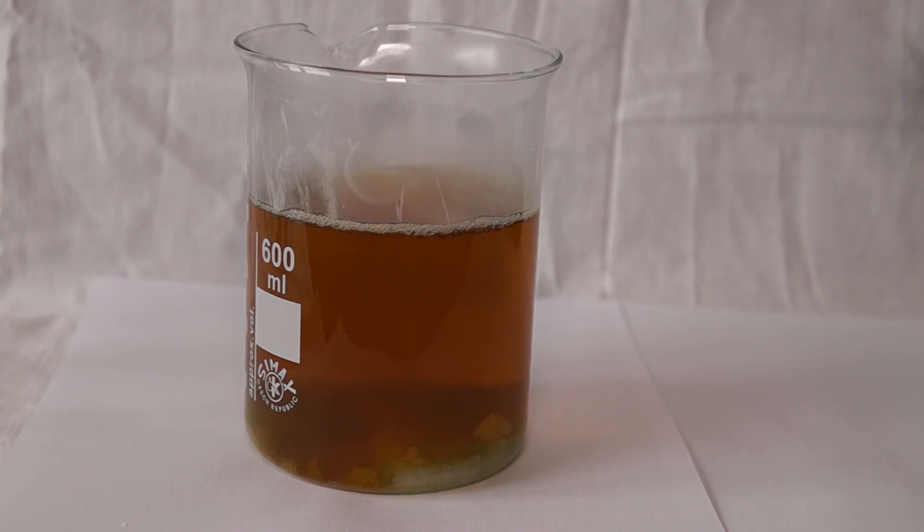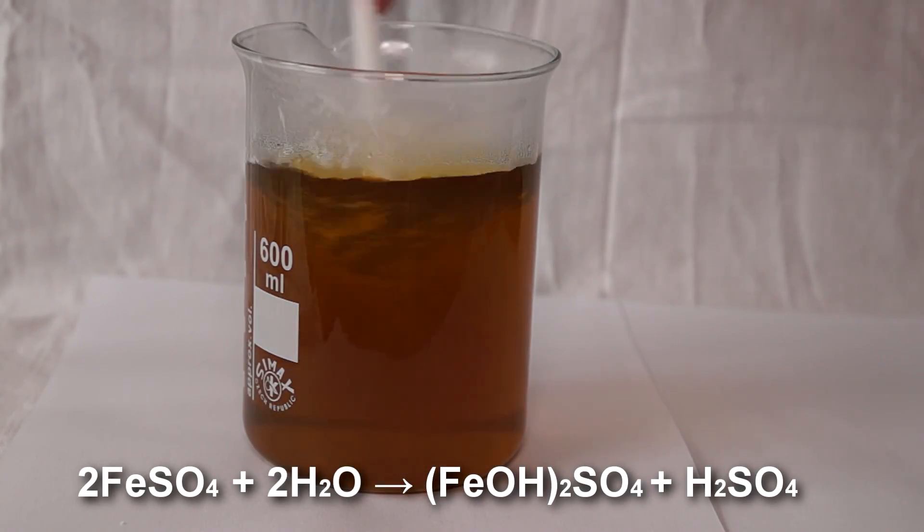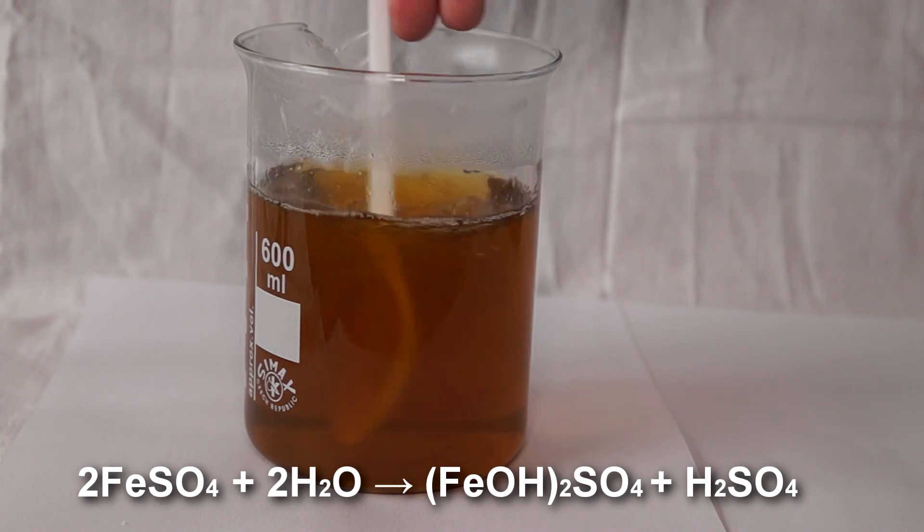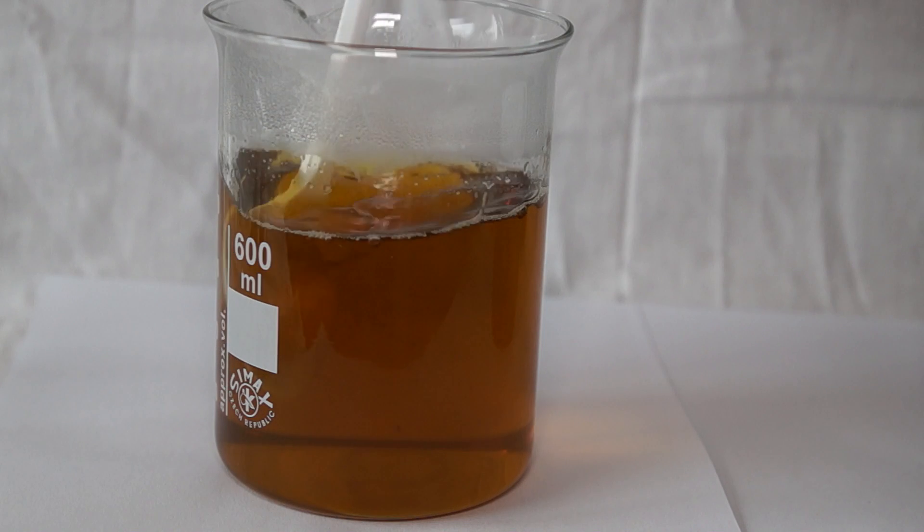Mix the solution until all the salt is dissolved. The solution will begin to acquire a brown color due to hydrolysis of iron(II) sulfate. Now we leave the solution for a day to cool down and to precipitate out the seed crystals.